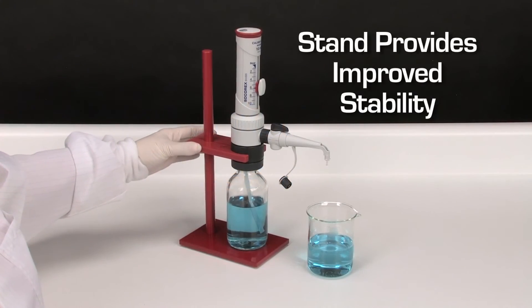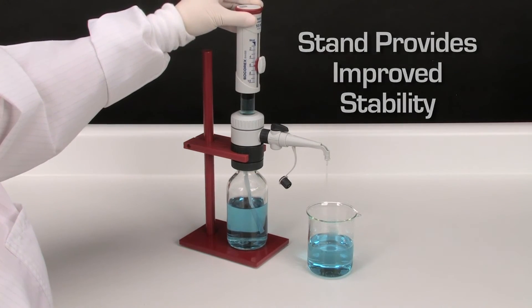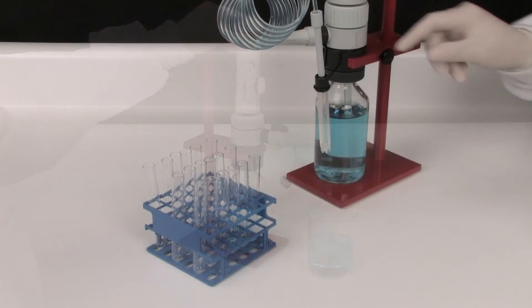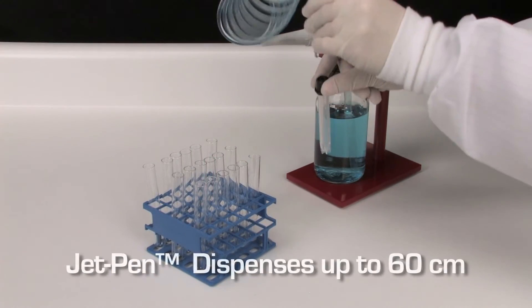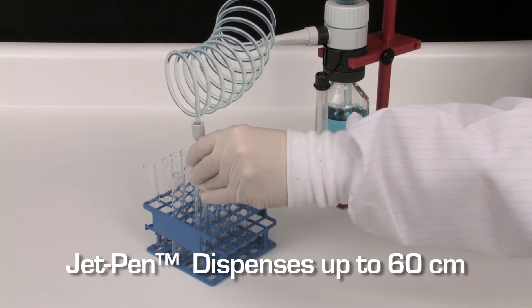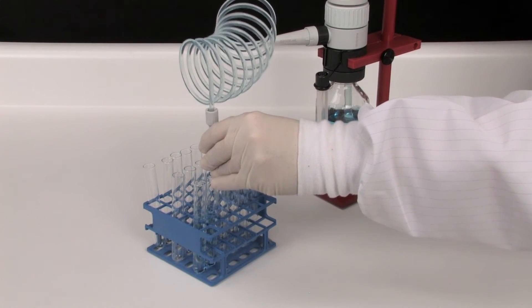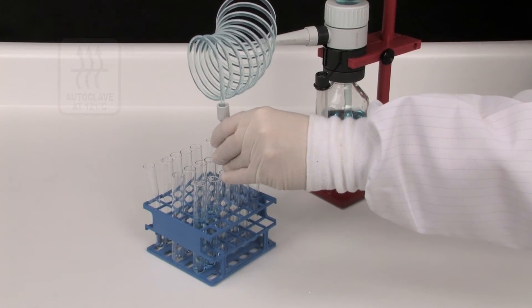The specially designed stand holds a dispenser when attached to a small bottle. Spiral tubing and the delivery jet pen help dispense material into vessels with maximum comfort within a 60-centimeter distance. No tools are needed for assembly or removal for cleaning.